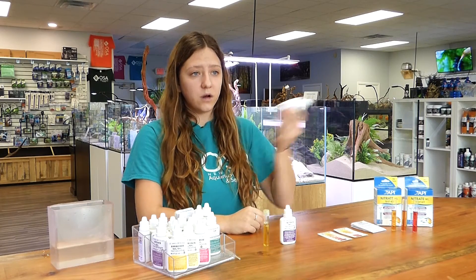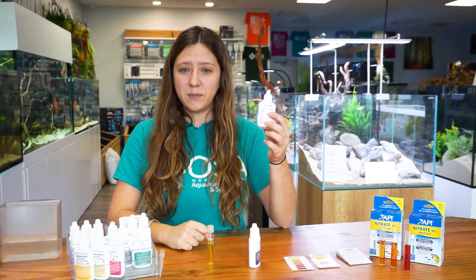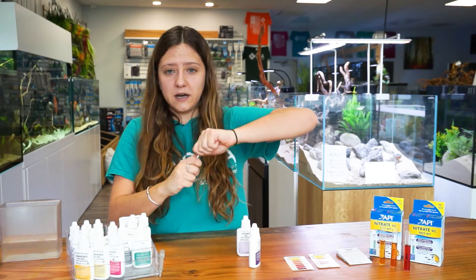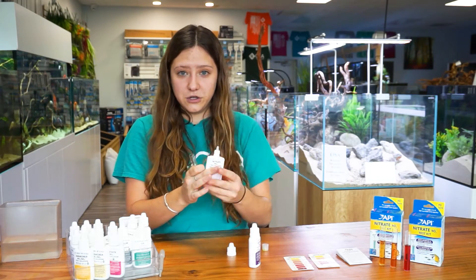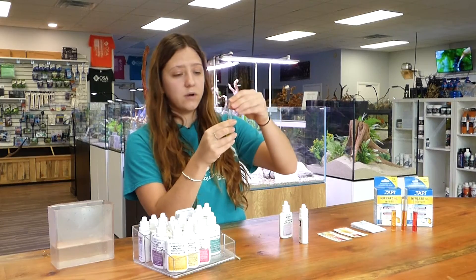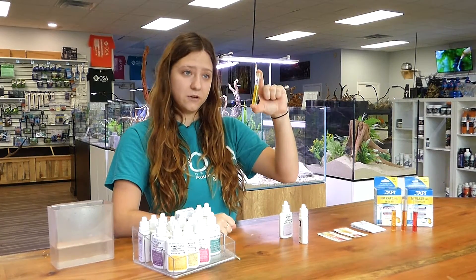Next, we are going to take bottle number two and vigorously shake it for 30 seconds. After thoroughly shaking bottle number two for 30 seconds, you are going to uncap your test tube and add ten drops into your tube. After adding ten drops, you are going to recap your test tube and shake vigorously for another minute.